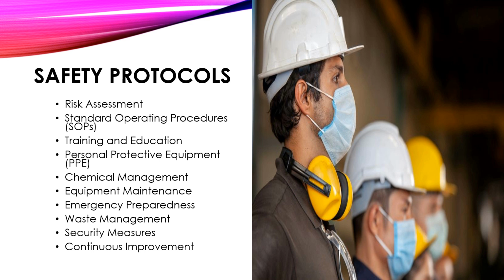Waste management. This involves proper segregation, labeling, storage, and disposal of laboratory waste materials, including hazardous chemicals, biohazards, and sharps, in accordance with regulatory requirements to prevent environmental contamination and health risks. Security measures. This involves implementing access control measures, security protocols, and surveillance systems to prevent unauthorized access to laboratory facilities or sensitive materials, safeguarding against theft, sabotage, or misuse.